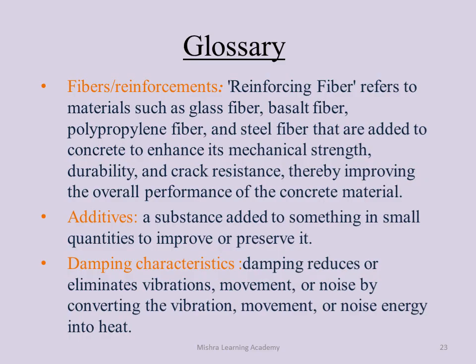Then the damping characteristic. Damping reduces or eliminates vibration, movement, or noise by converting the vibration, movement, or noise energy into heat.